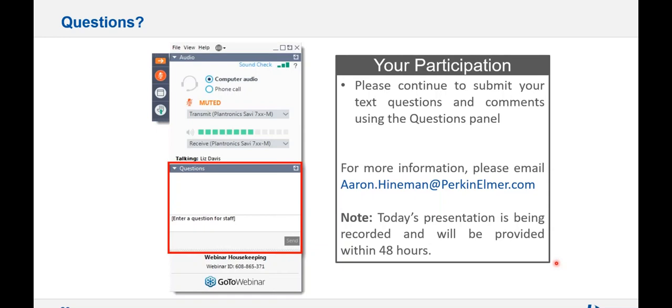Yes, zinc is very sensitive and very prone to contamination, so you have to be a detective and try to figure out where it's coming from. That's probably a case where somebody would cover the furnace when they're not using it. But that's a difficult element to get a good blank on. Not even on graphite furnace, I see it on ICP and ICP-MS. It can be a tough one.